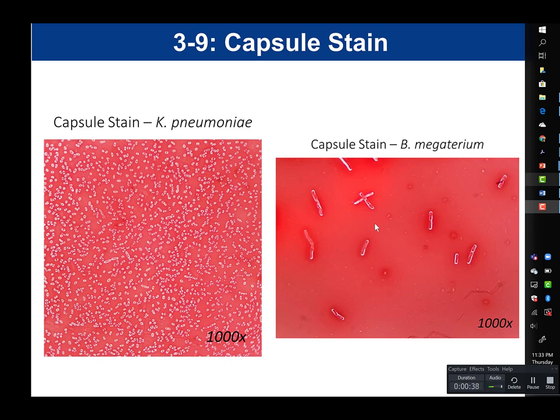B. megaterium are bacillus-shaped, so they are rod-shaped. In both slides, the background is stained red because of the Congo Red, which is a negative stain repelled by the cell. The cells themselves are stained with Saffranin — a basic dye carrying a positive charge, attracted to the cell — so the cells appear red. The clear part in both images is the capsule, visible around both Klebsiella pneumoniae and Bacillus megaterium. The capsule is colorless, not stained by either Congo Red or Saffranin.